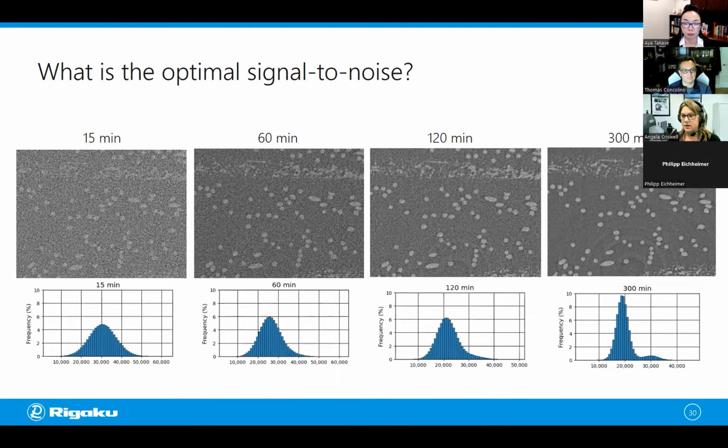And there's ultimately the error that we bring into the experiment because we mislabel things as well. But that might be the path you go. And it turns out that Geodict has all of these capabilities, so you can try them out on your own. You can use noise reduction, you can use machine learning, for example.